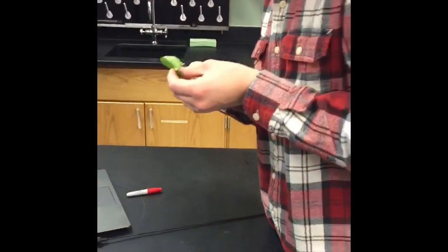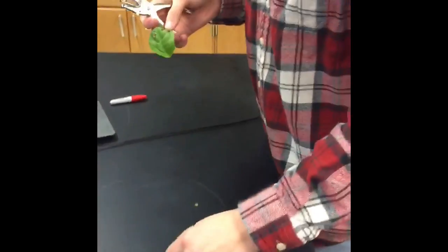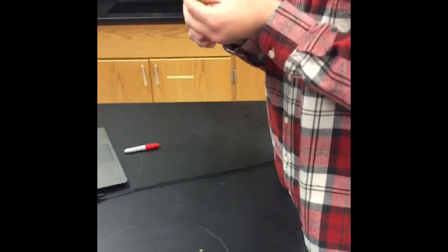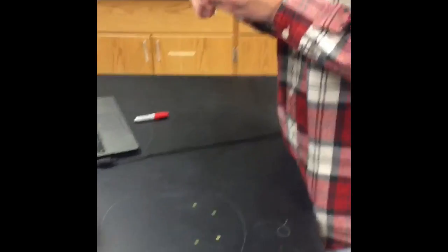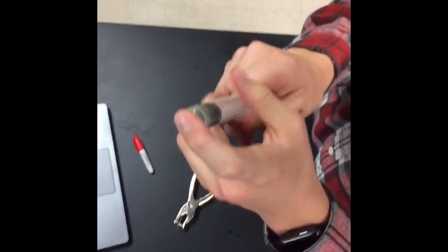You're videoing me? Live action of the hole punching of the 10 discs for the first trial, which is the control run. Jake is currently using the hole punch to punch out the small discs out of the baby spinach. Tell me when you're ready. Good.